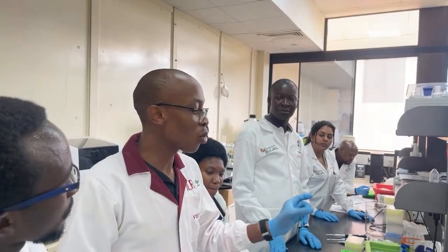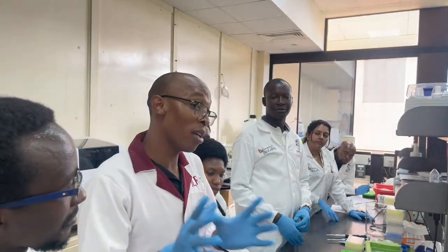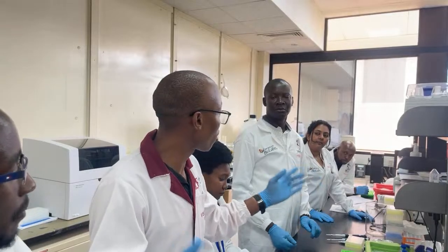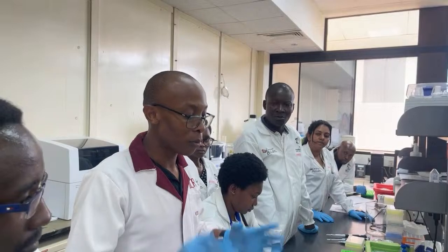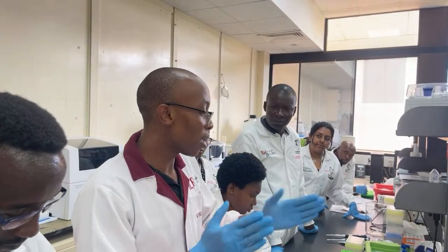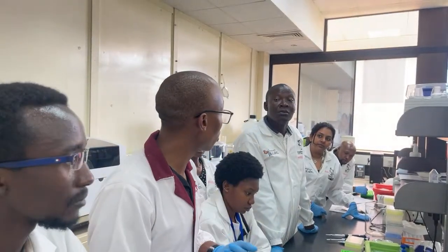Bacteria and viruses are so small. Even if you get a 7 kb fragment, probably when you do assembly, you're going to get the entire chromosome. So here we're talking about diploid, tetraploid, whatever. You want to try and get as long fragments as possible so that you can try and assemble all the chromosomes. So anyone working or planning to do any long reads, first, anything that is not fungi or bacteria, rather use high molecular weight extraction.